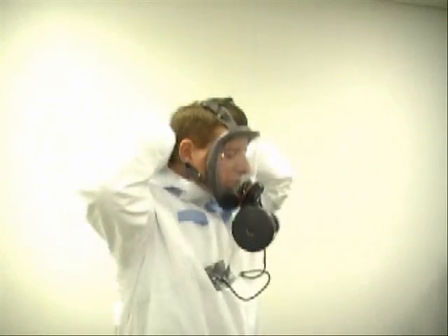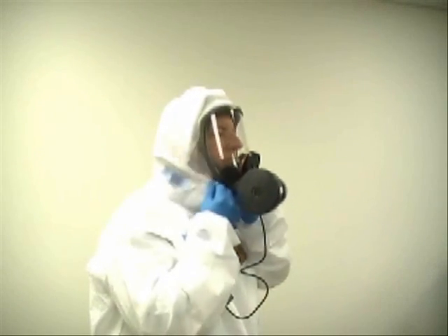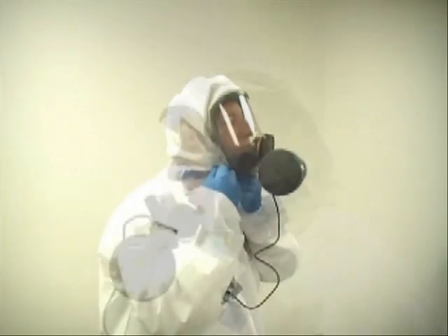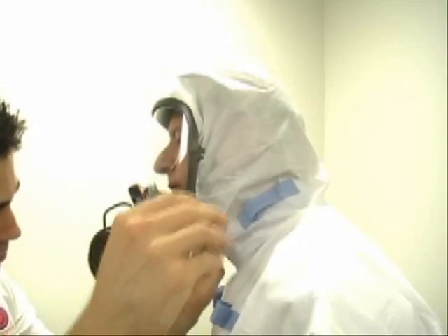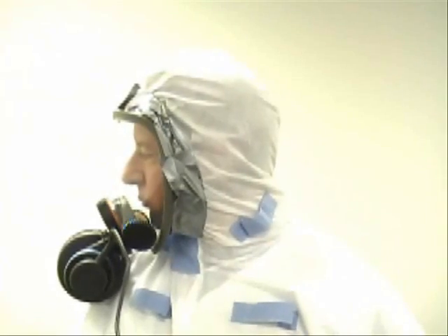Once the respirator has been properly fitted, pull the hood over the edge of the respirator and secure the hood flap to create a comfortable and secure closure. Then tape the edge around the respirator and hood to ensure a sealed closure. The extended blue tab also makes it easy for IH RadCon supervisors and coworkers to check the neck area to ensure proper closure even from a distance.